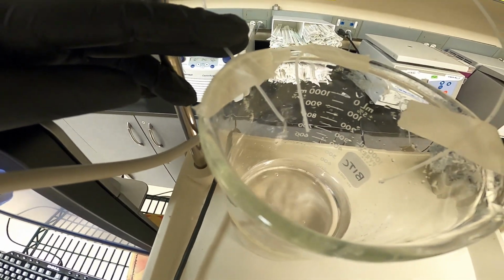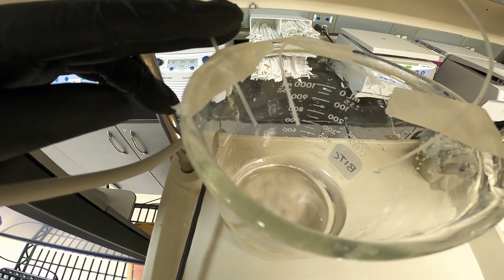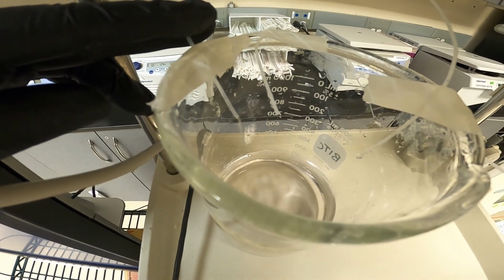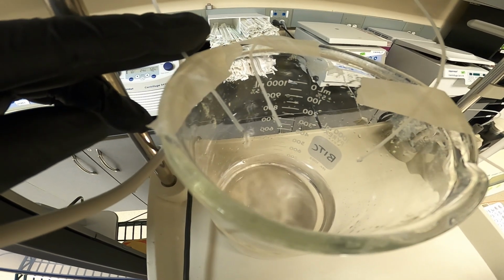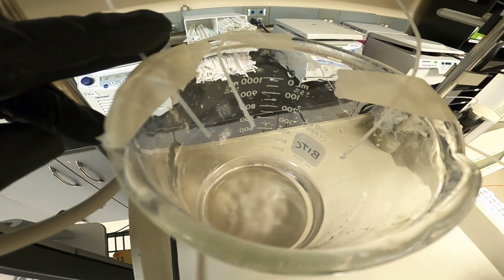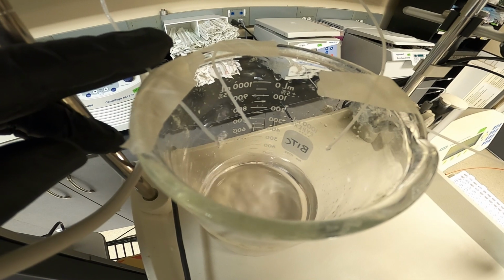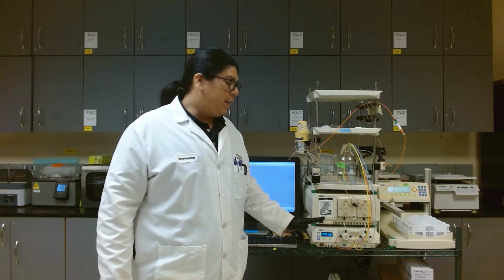So here we can see that we have a steady stream of our water that we're flushing through the system coming out. If there were weird pulsations or air bubbles coming out, we would just continue to run. But once you've purged for approximately 30 seconds and you've confirmed that there's a steady stream of liquid coming out, we'll go ahead and pause, and then we'll do the other 2 inlet lines. Okay, so now it's been about 30 seconds, so I'm going to press the A and B buttons again. You see the LED indicators are deactivated, so the purging has stopped.